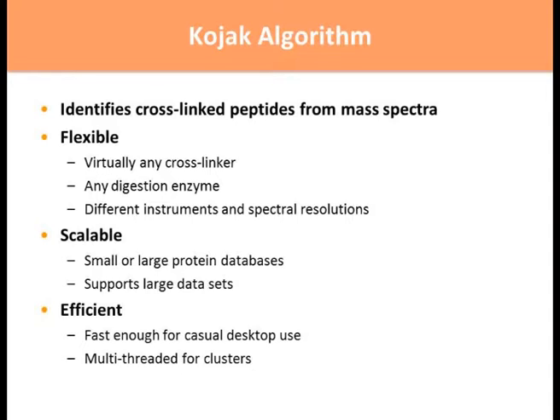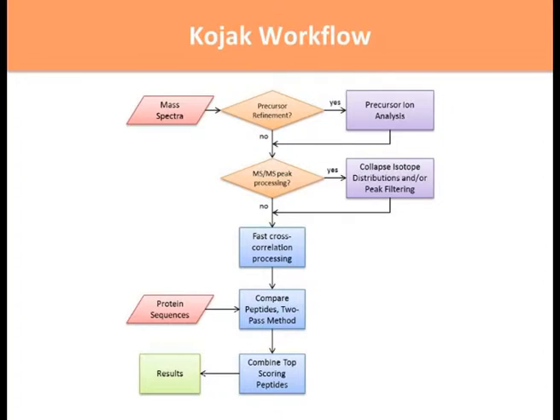In particular, we also have support for multi-threading and cluster computing so that you can even apply large data sets with large protein databases. And then finally, the efficiency is what makes all of this analysis possible in the whole process. The Kojak workflow is actually not too difficult.